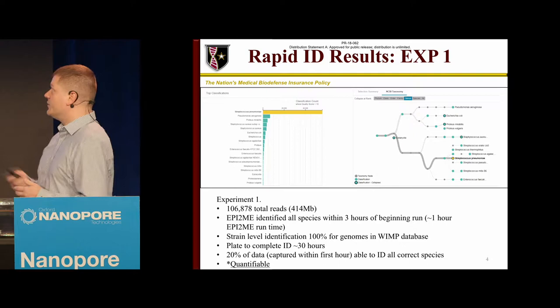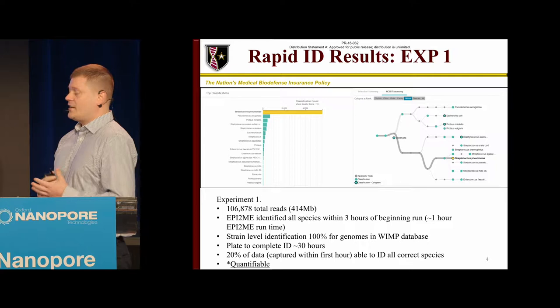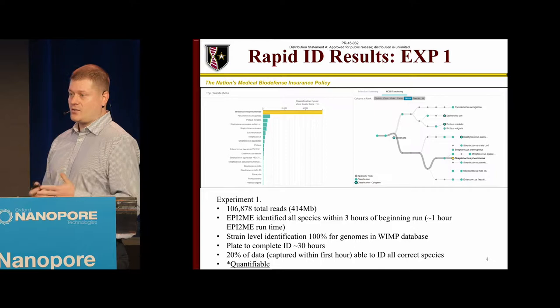Not surprisingly, in experiment one, we got about 106,000 reads, and we used Epi2ME, the WIMP workflow. It was able to correctly identify everything, all the ATCC strains, if they were in the database at the strain level, if not at the species level, within 3 hours of beginning the run, and we found out that using only 20% of the data, we were able to get the same results.